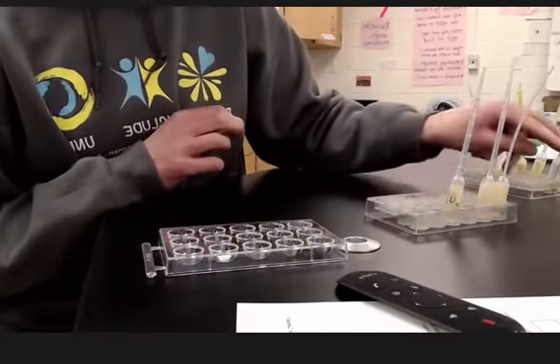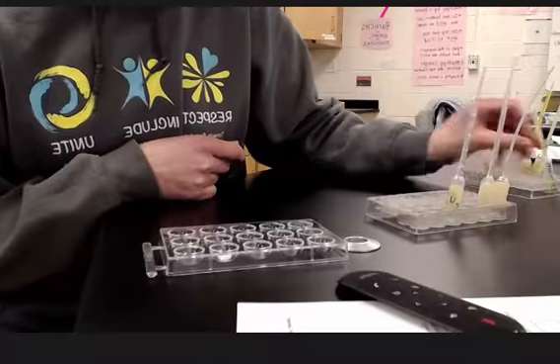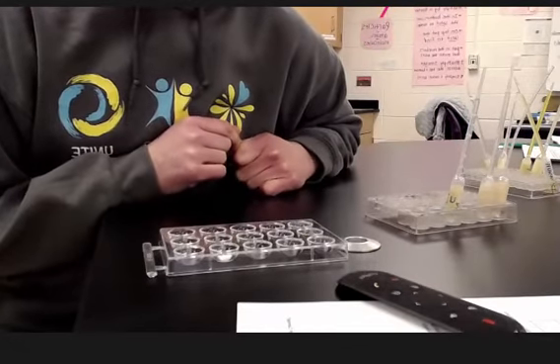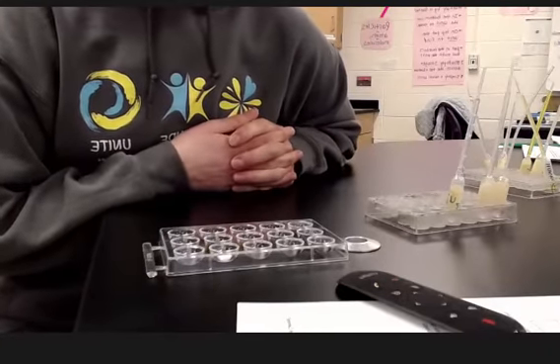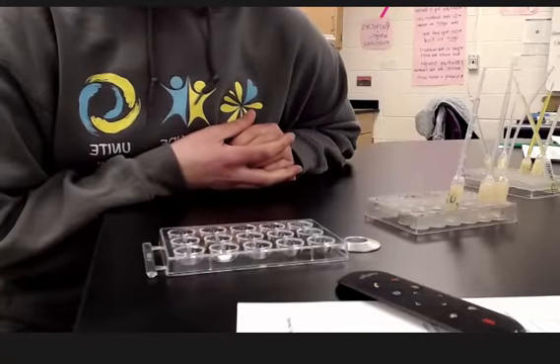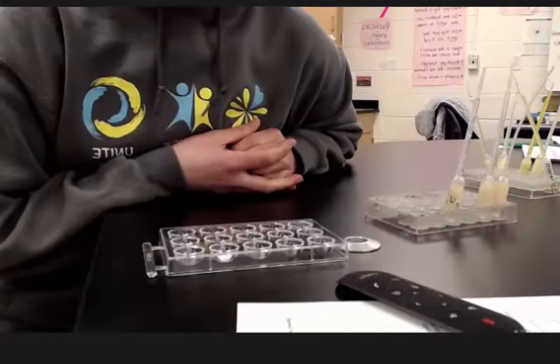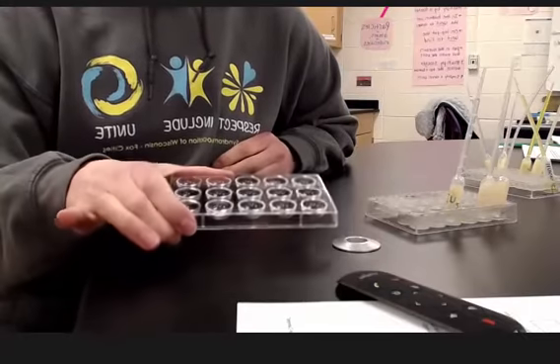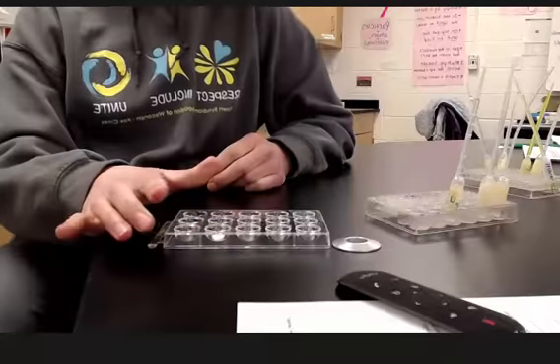For the unknown, there is a dropper labeled unknown. That's a mixture of 2 of the numbered solutions, and your job will be to figure out what that is. Okay, so please make sure you record careful data and then work on your analysis. The conclusion for this lab will be on Canvas. I will post it. You're going to do a QSER where you figure out and explain how you figure out the unknown. To clean up this lab, you can just wash out your spot plate in the sink.